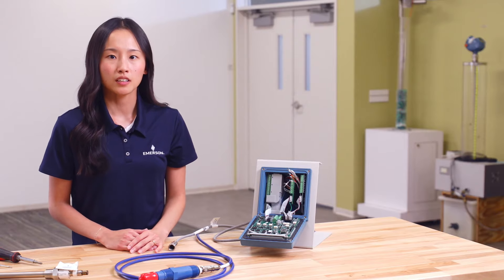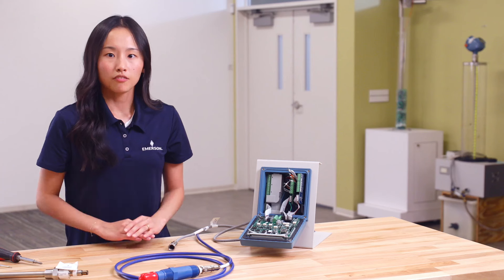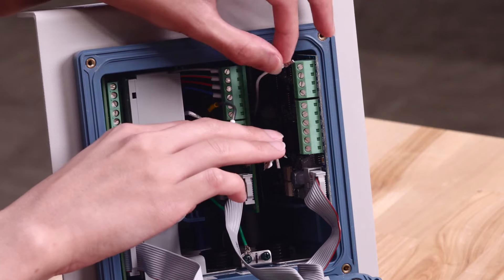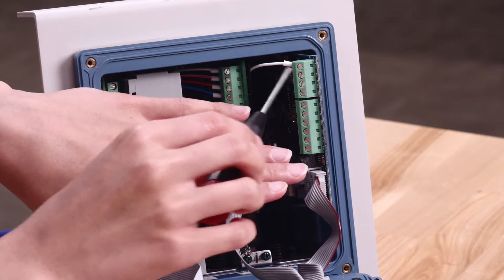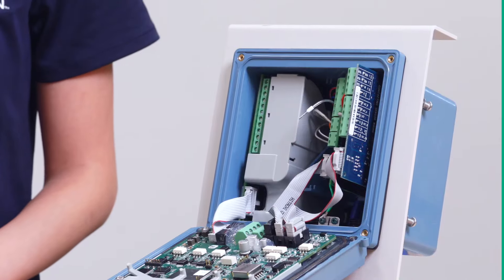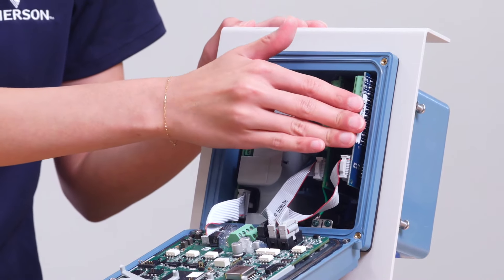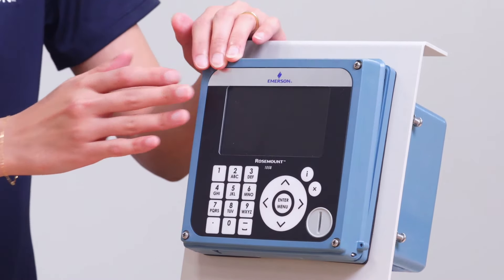Partially pull out the contacting conductivity sensor card and follow the wiring diagram to connect each wire to its respective location, using your screwdriver to secure each connection. After all the wires are in place, slide the contacting conductivity sensor card back into its original position, close the cover of the transmitter, and install the four screws.